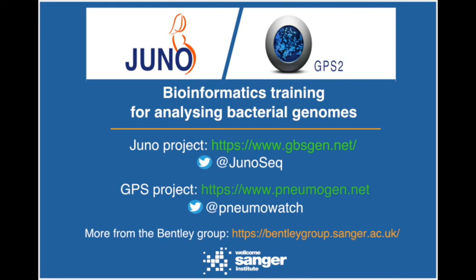Thanks, Dorota. And last but not least, what method, this is specifically for Steph, I suppose, will you use for phylogenetic tree calculation in GPS? So in the GPS, both the species-wide tree and the lineage-specific tree are calculated using a method called maximum likelihood.